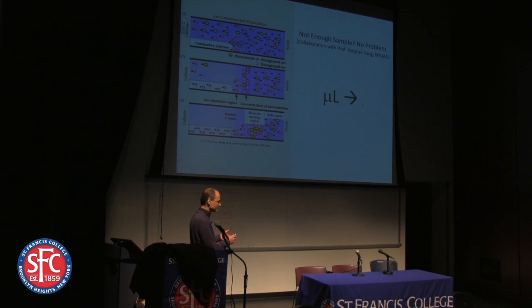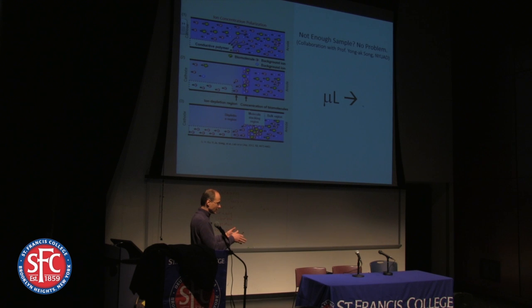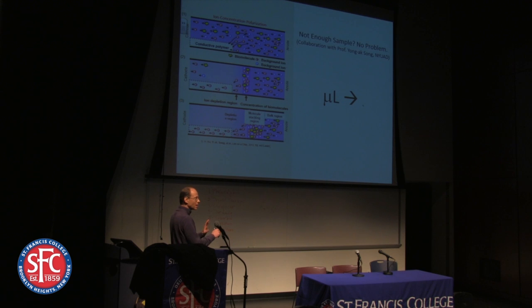And what he does, he can concentrate any charged species. So you can introduce a relatively dilute sample of DNA, and you can concentrate it to concentrations where you can quickly realize surface hybridization detection without use of any enzyme. So no PCR, no in vitro transcription, no whole genome amplification, no enzyme use. But you need low ionic strength. So morpholinos were perfect for this.